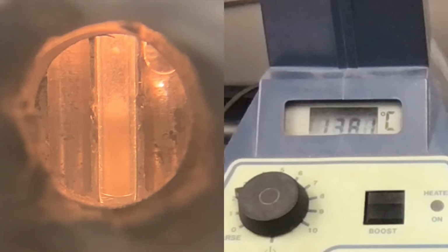Okay, well, I used my laptop computer to film the temperature reading on the melting point apparatus, and apparently when my laptop went into the screensaver mode, it just decided to take a still image for several minutes, so it never did record the temperature going up, and so there's no point in watching this video. This experiment was not adequately recorded, so on your lab reports you may go ahead and place NA, capital N, capital A, which stands for not applicable. We cannot do this measurement in the small amount of time remaining.